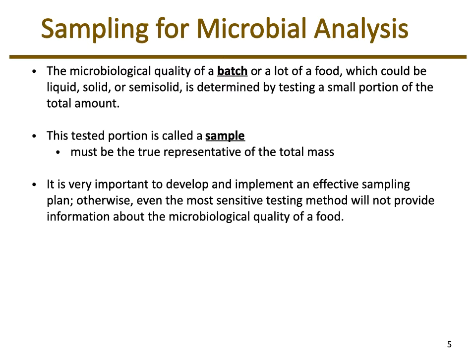So they can be different sizes, but we're only going to test a small portion of that, and that tested portion would be known as the sample. And the determination of how you come up with the sampling, a lot of times that is in the standard operating protocols, the protocols that are going to govern what methods you use to test for which organisms.